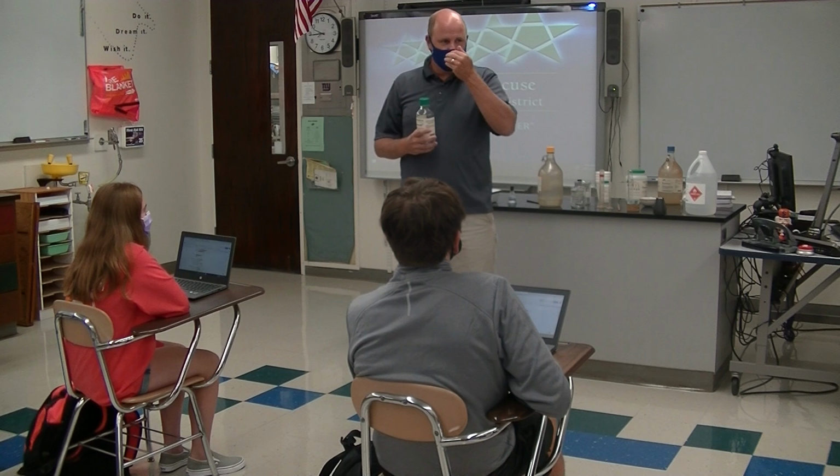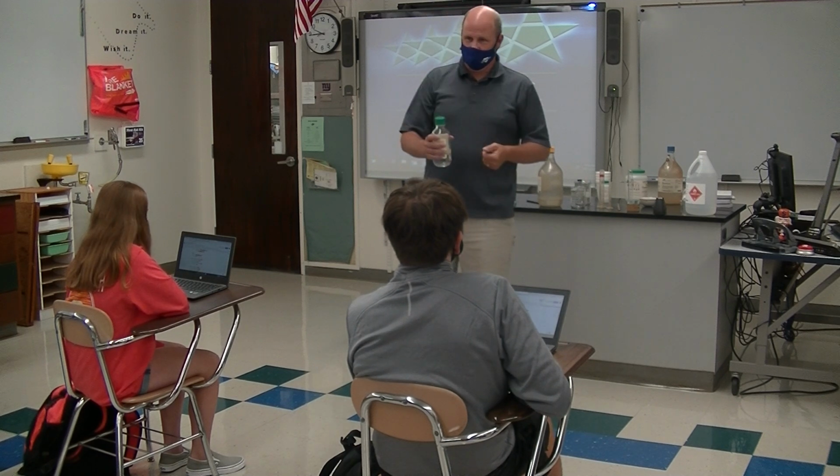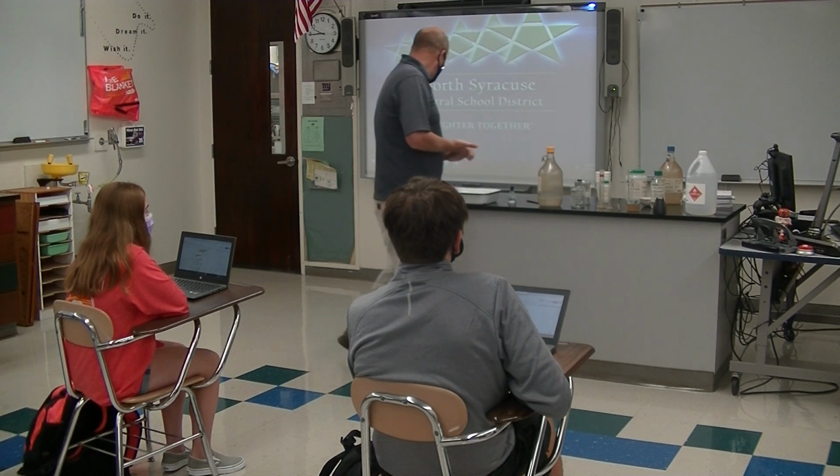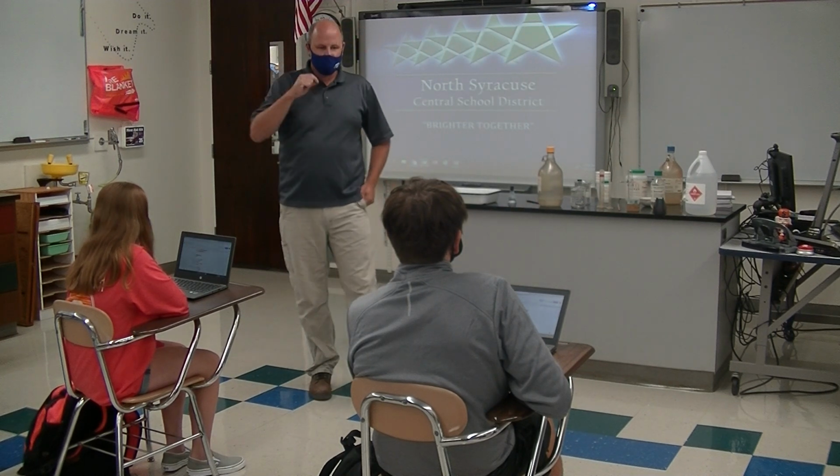But I showed you how to do it. Sometimes I'll just have people smell it without wafting it, and it does funny things to their eyes. So we don't do that. So how do you detect an odor? You waft carefully.